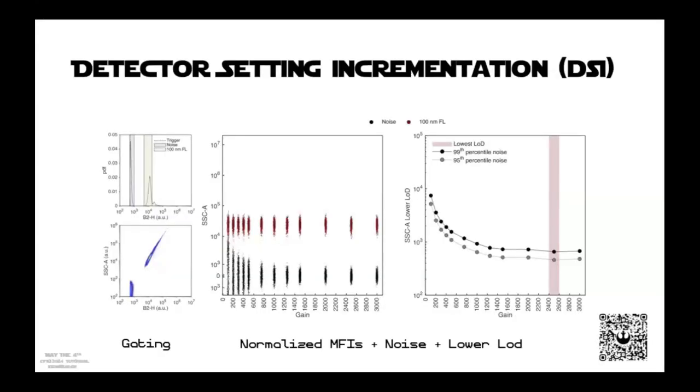One of the unique things about this methodology is that we are using the system optoelectronic noise floor. And you can see that in the top left population in the blue. This is a unique population that you will all have, and it's kind of subsampling the baseline, just the very tip of it. It's really important to know your noise floor. It's also important, as Vera said, to clean your instrument so you're actually looking at the true noise floor rather than just debris or dirt in your system.